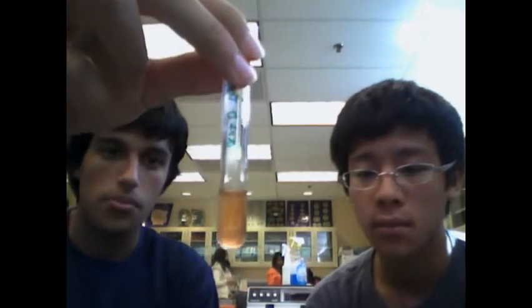So, as you know, we are talking about the optimal temperature and optimal pH for enzymes. And we are testing the catechol oxidase enzyme that is found in plant cells, in fruit, which reacts with catechol and oxygen when it is exposed, and produces the product benzoquinone, which is an antimicrobial agent, which protects the fruit. So here we have the first test tube, where we put in 1 milliliter of catechol, no water, and 1 milliliter of catechol oxidase enzyme.